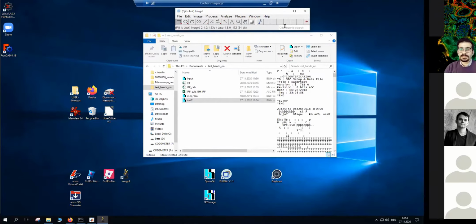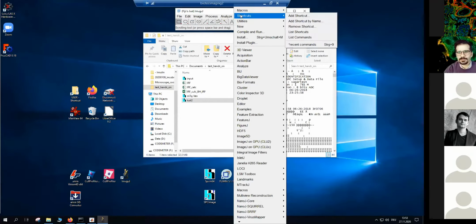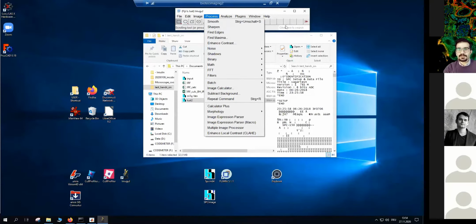And one thing is that you can find so many tools in this tiny user interface. Just clicking on the plugin and you see the list of the plugins, and these are not all available. So these are not everything you can do. That's depending on what you want to do. There are tools in Fiji, or you can ask the community, and there are people in this community that would be happy to develop them for you. So let's start with what we need.